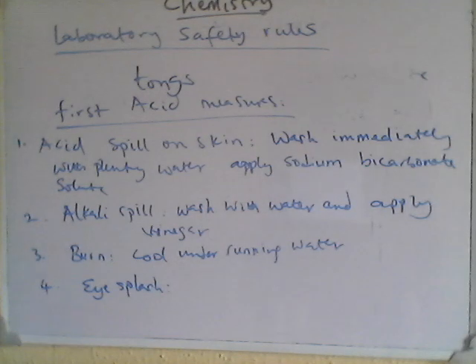Now we'll go into the maintenance of laboratory apparatus and handling. How do we maintain laboratory apparatus? For glassware, when you are finished using it, you clean after use. Store dry equipment in proper places.